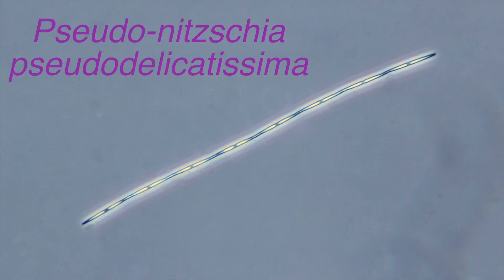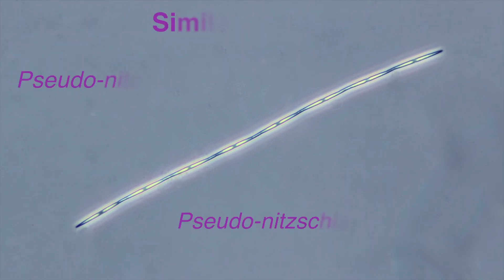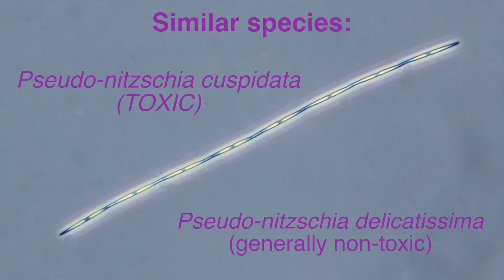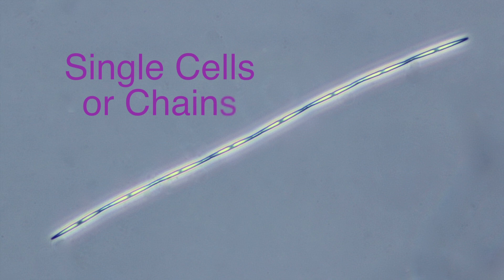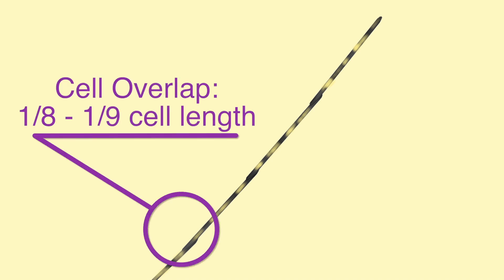Pseudo-nitzschia pseudodelicatissima, a small-type Pseudo-nitzschia species, is toxic and similar under the light microscope to Pseudo-nitzschia cuspidata, which is also generally toxic, and Pseudo-nitzschia delicatissima, which is generally non-toxic. This group can be found as single cells or in chains, and the cell ends generally appear pointed with a cell overlap in chains that covers about one-eighth to one-ninth of cell length.